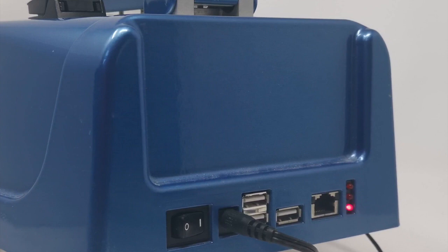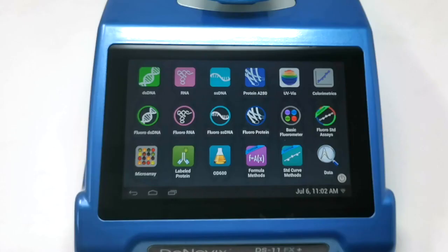We also have an ethernet connector. These instruments can connect to your network either through ethernet or via onboard Wi-Fi. This gives us a range of exporting options using the internet and network drives, as well as USB memory sticks.